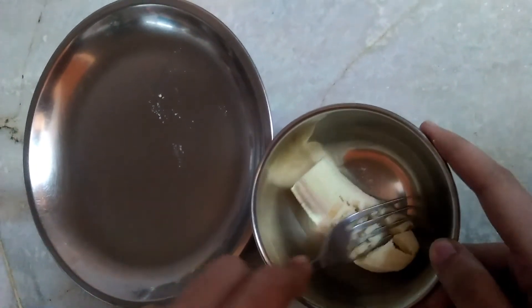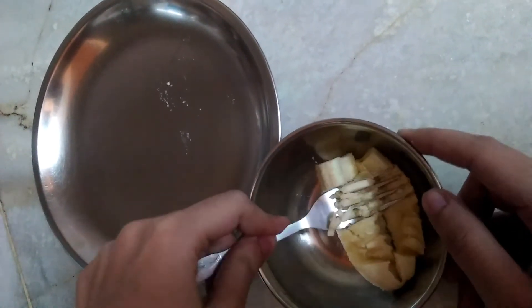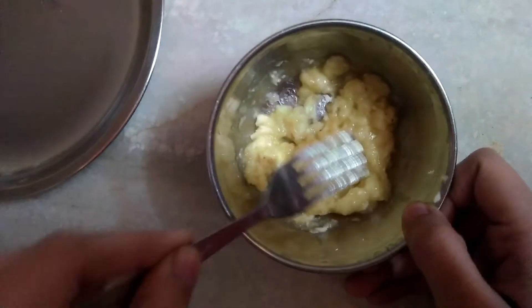Now take half a banana and crush it with the help of a fork, or you can also use a pestle and mortar to crush it. As you can see, we have got this paste.